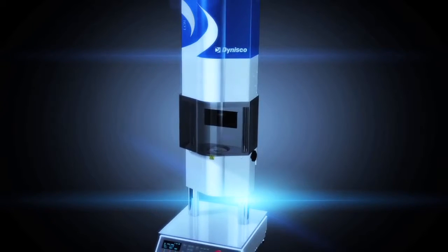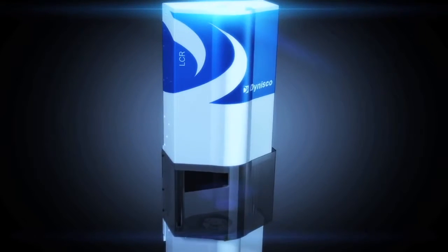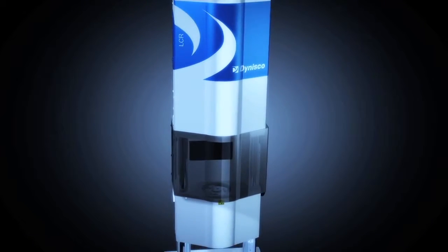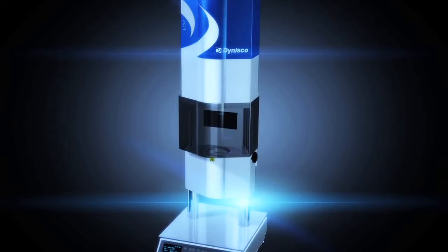Dynisco LCR 7000 series capillary reometers are industry-leading high-performance materials testers offering up to 45 shear stress or shear rate data points per tube loading.